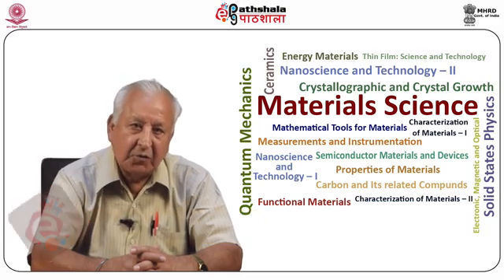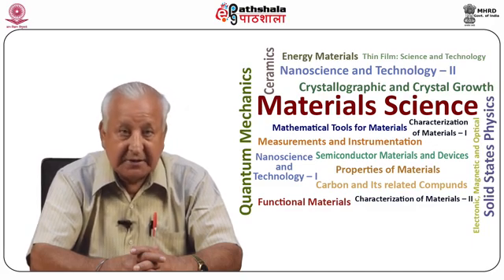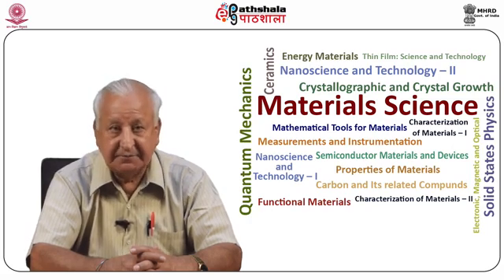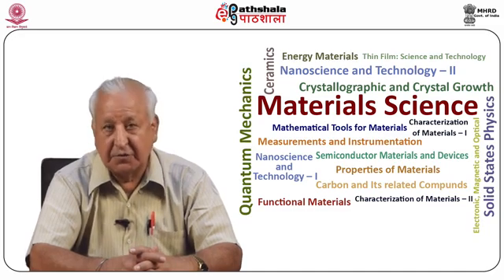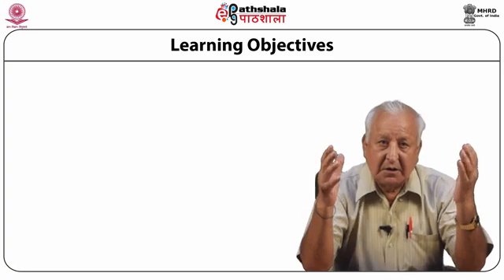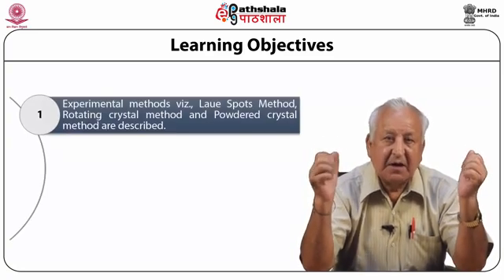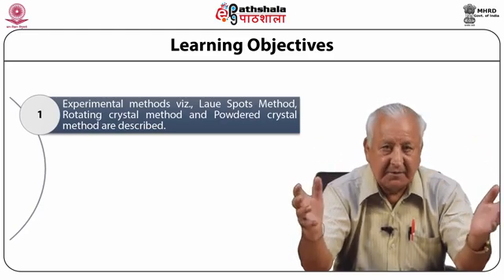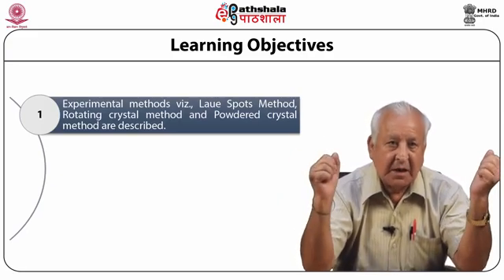Today we are going to discuss a module entitled Experimental Methods for X-ray Diffraction under the paper Crystallography and Crystal Growth. Let us know what we shall learn about these X-rays today. Experimental methods, namely Laue spots method, rotating crystal method, and powdered crystal method are described.